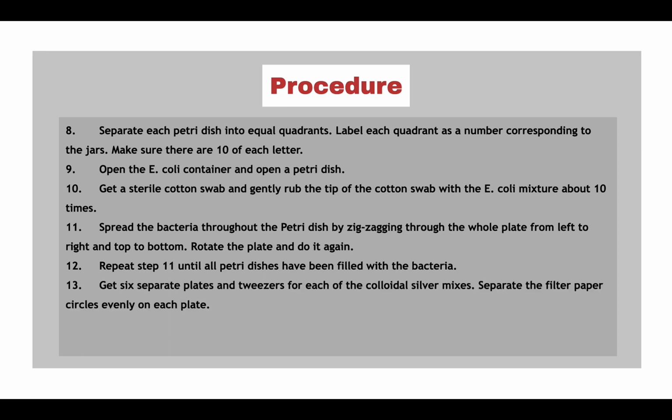13. Get 6 separate plates and tweezers for each of the colloidal silver mixes. Separate the filter paper circles evenly on each plate.